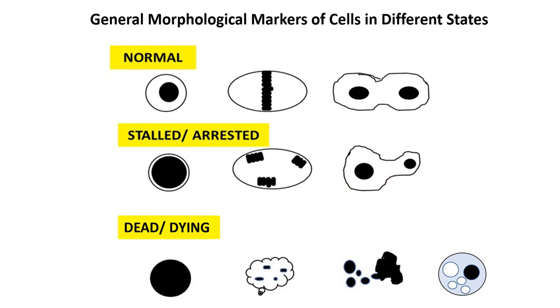Finally, you can have cells in your culture that are dead and dying. That's going to be present regardless of whether you have a normal, typical cell culture with no issues and untreated cells, or cells that are diseased, damaged, or treated with a drug that may cause that to happen. You will always have some dead and dying cells in there. Now, these can show up in multiple ways. If you're looking at cells that are still in culture, still in media, they may show up as floaters.